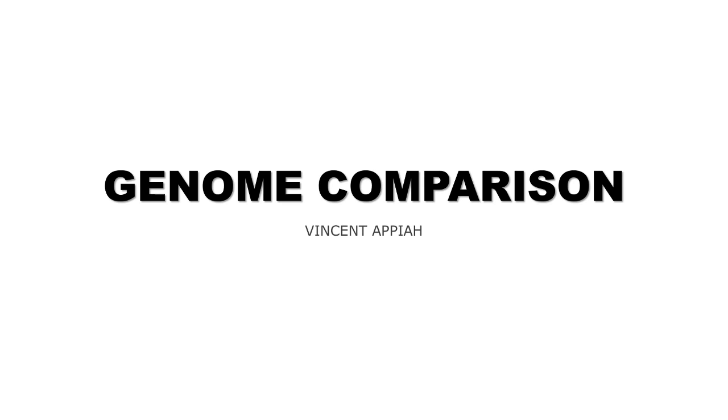Today we are going to look at genome comparison. Many a times one of the questions we want to answer with our genomes is how similar they are to a particular reference genome, for example. There are a number of ways to go about this, but our focus today will be to use the tool called BRIG, B-R-I-G, to do that analysis.